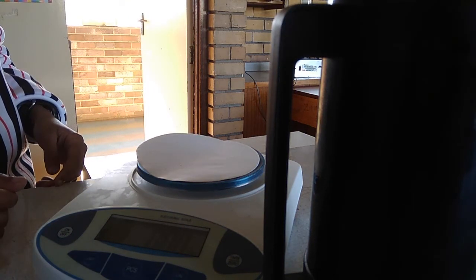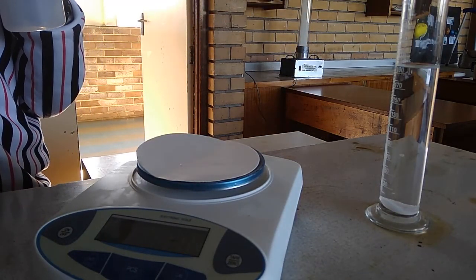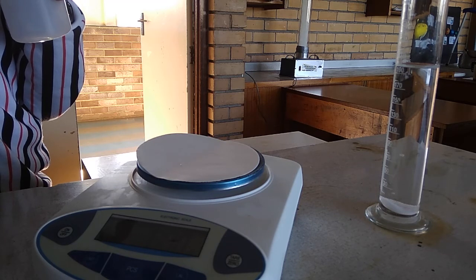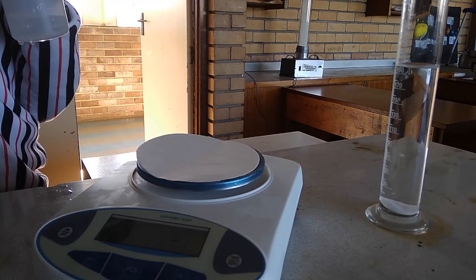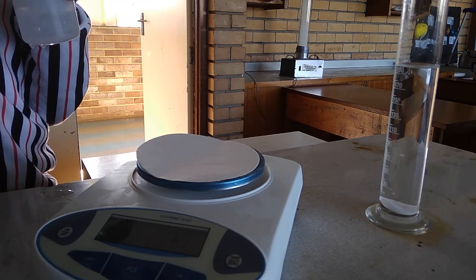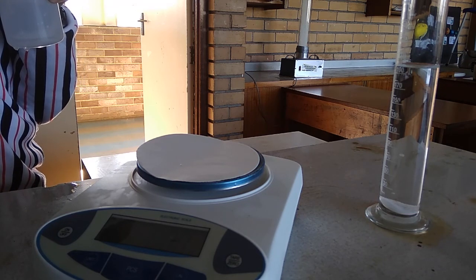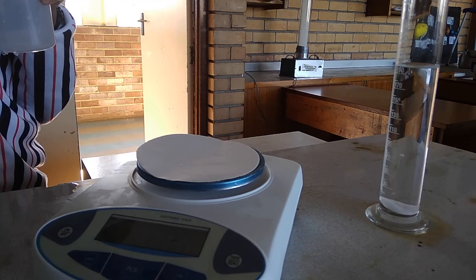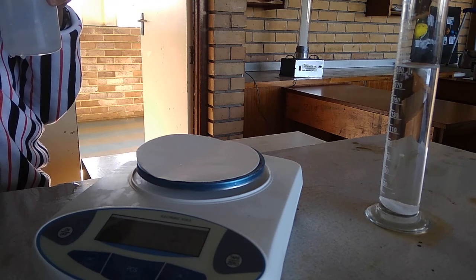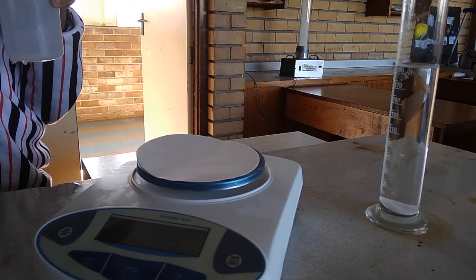Okay, just pour water in there and then put that on. It's called a wash bottle. So just fill the wash bottle. No pressure. You can put all the rest of that water in there. It's no problem. Okay, it's only water. It doesn't matter if you throw it everywhere. So much water is in. Okay, no, that's fine. You can stop. Screw the lid on.